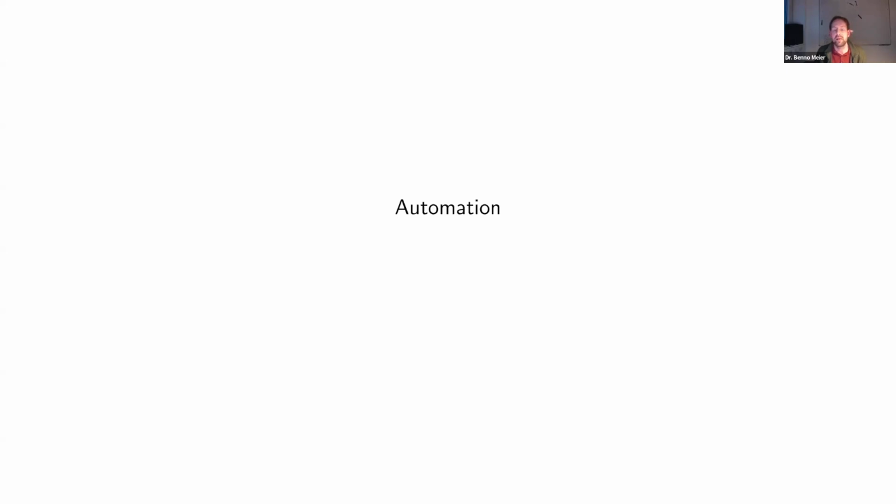So if you run DNP experiments manually, then you have to be aware that a human is not a machine. So on the one hand, of course, you're limited in the time that you can use the machine, but then also the machine has a bit of its own life. So for example, there's this helium level inside the sample space that is difficult to control perfectly.